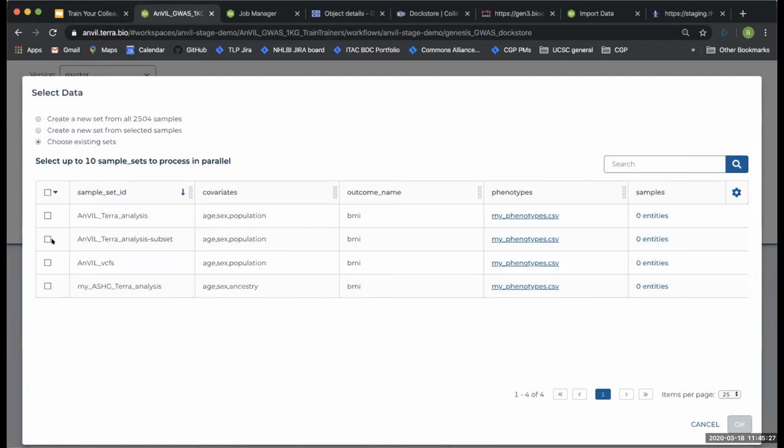Yeah, kind of. When I did a lot of trial and error, that looks like how it's behaving, but I wanted someone to confirm that that's what it is. Yeah, it's because the root entity is the thing that's specifying what the workflow expects. That's really what it comes down to. Okay, that makes sense. Thank you. You're welcome.